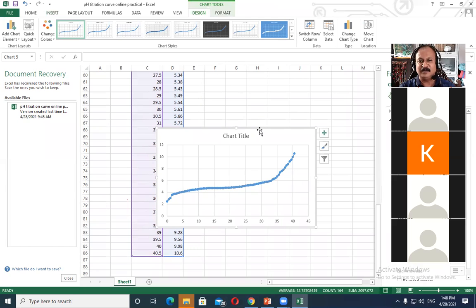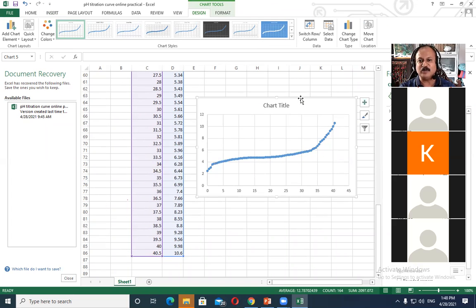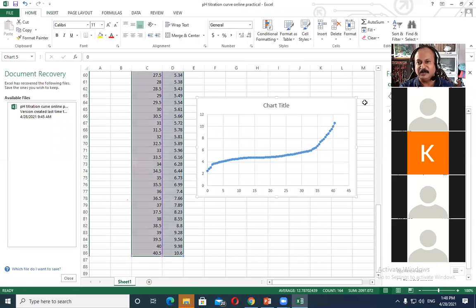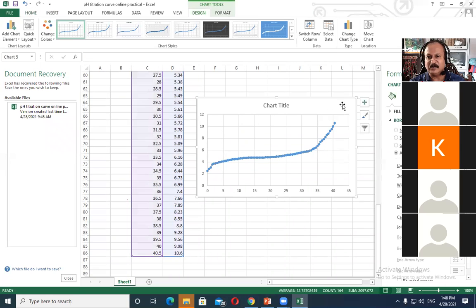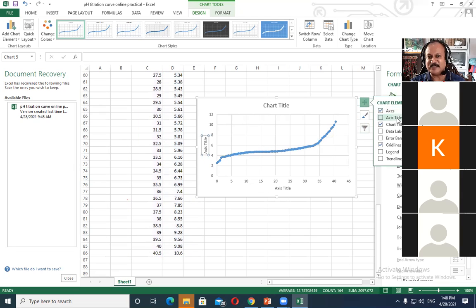राइट। तो ये मेरा चार्ट बन गया। चार्ट बनाना बहुत इजी है। एंड देन ये क्या है इधर, प्लस, ओके इधर है देखो, just a minute, I'll shift this part here and okay, can you see these options? ये नहीं दिखा था मेरे को पहले. Okay, so if I go to this plus sign, then axis title, देखो इधर axis title दिख रहा है. Can you see that? हाँ हाँ यही वाला. Okay. Yes, sir. ये मेरे को मिल गया अभी.